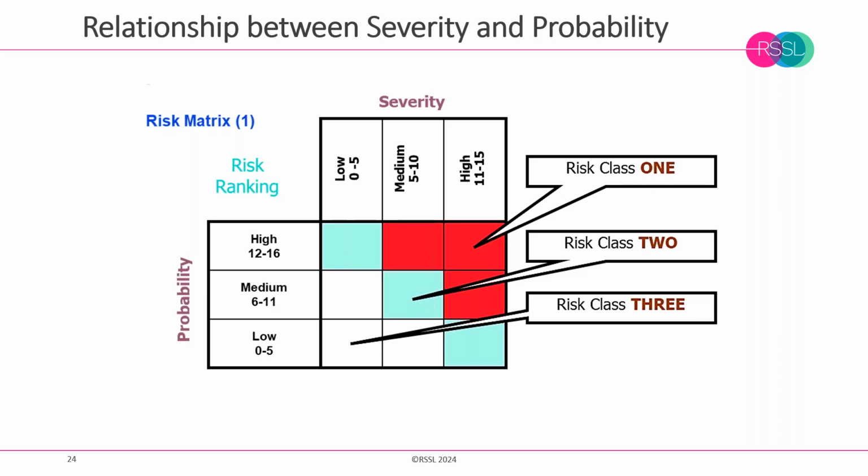And there's a slightly greater weighting towards probability than severity, because if contamination is more likely, then that is potentially the worst situation that could occur. So this is a little bit abstract. It will hopefully become clearer as we work through this model.